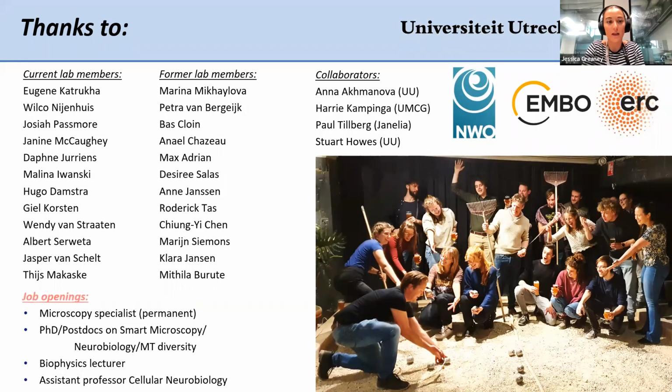Okay, so we also have a question from the chat. The question is from Hanadi. Hanadi, you're welcome to jump in and read it out yourself. If you'd like to, just raise your hand, or I can read it out for you. So we have the question. They've said, thanks for this very interesting talk. You mentioned staining for stable microtubules, but are there stains to stain dynamic microtubules?